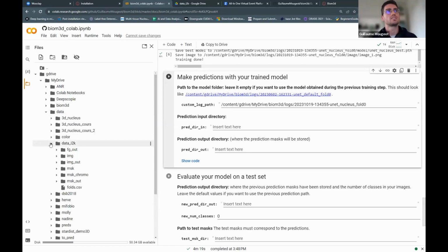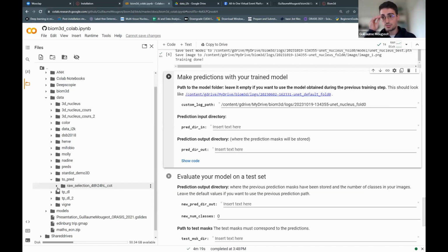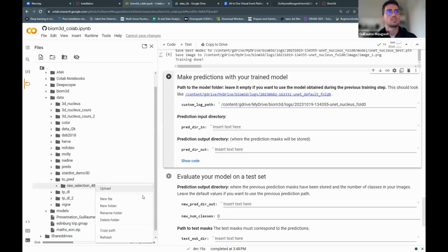And if you have, like me, already uploaded the folder that is called row selection, etc., it should be in one of the 4 folders in the dataset that you downloaded. You can copy this path. This folder contained the 120 images. Copy path and paste it here.